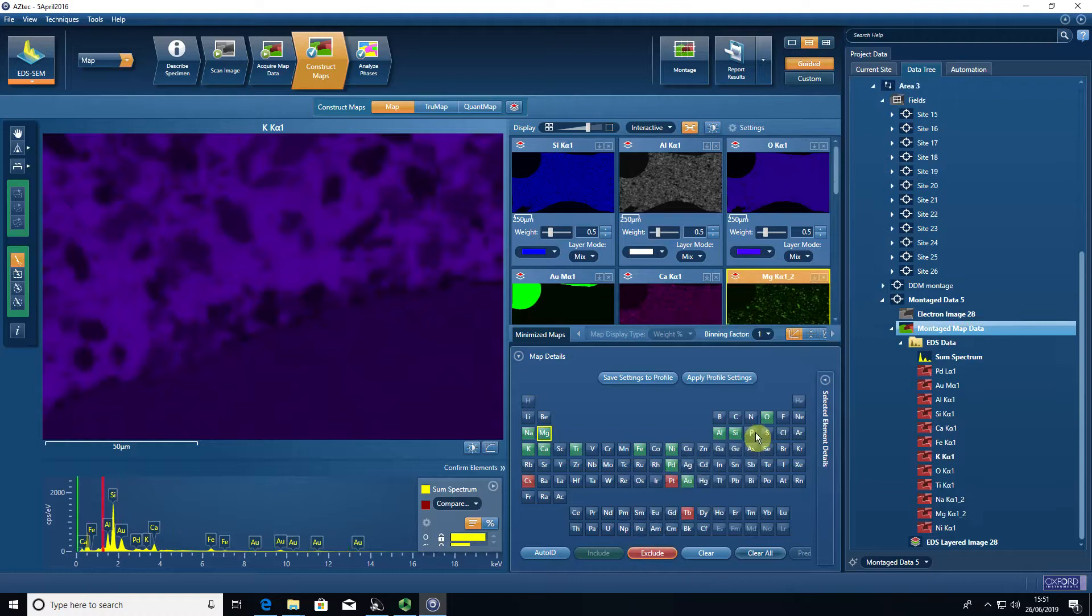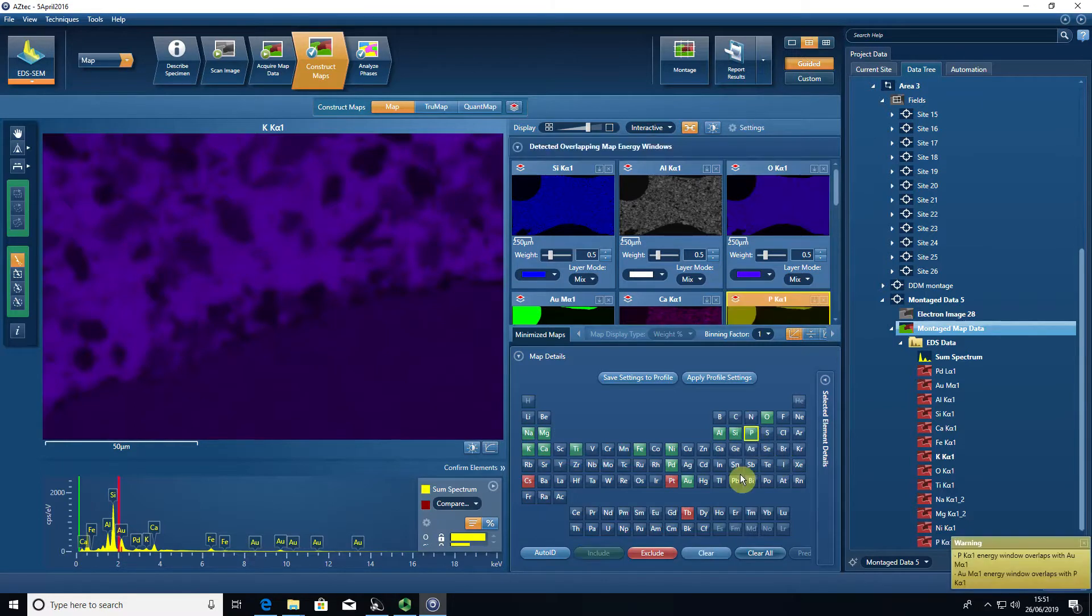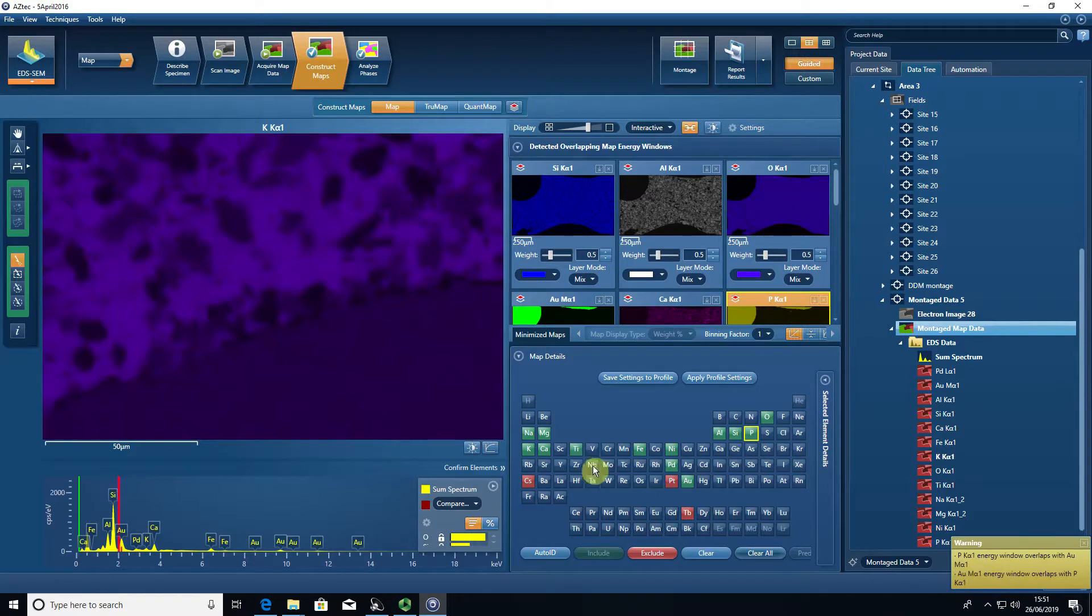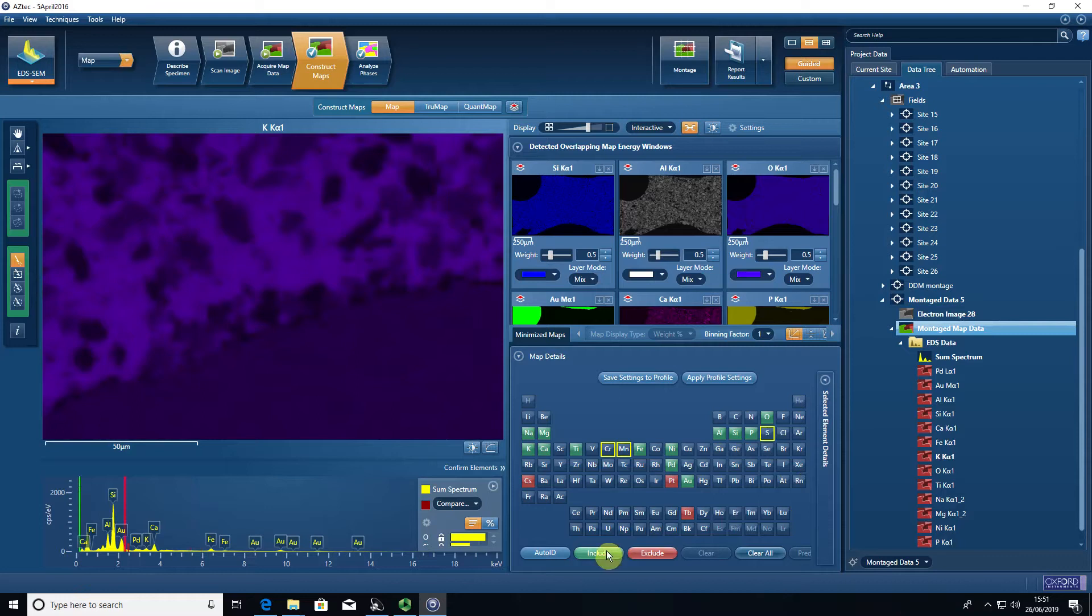I'm going to include—this is a silicate rock, so I'm going to include phosphorus. I think that's probably present, so I double click that and it's added phosphorus. It's telling me it's overlapping with the gold window, which could be a problem. And we'll have manganese, chromium, possibly sulfur. So I'll include those elements.